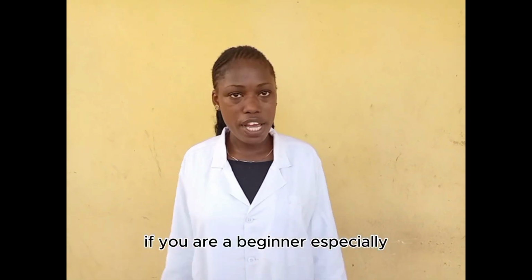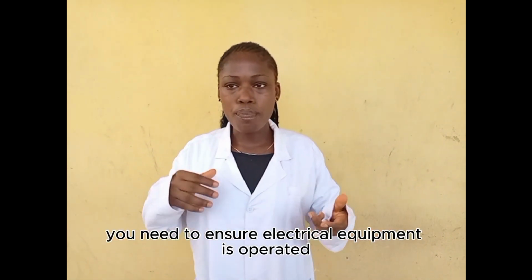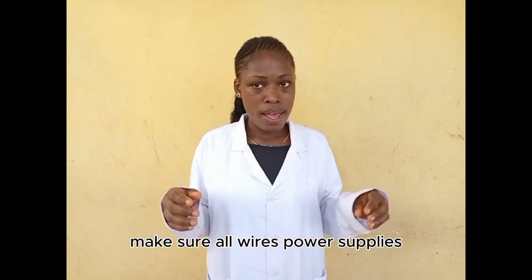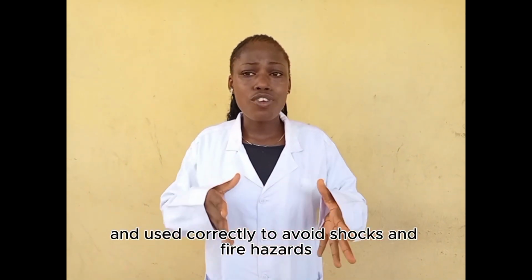If you're a beginner especially, then you need to ensure electrical equipment is operated safely. Since electrophoresis uses electricity, make sure all wires, power supplies, and tanks are in good condition and used correctly to avoid shocks and fire.